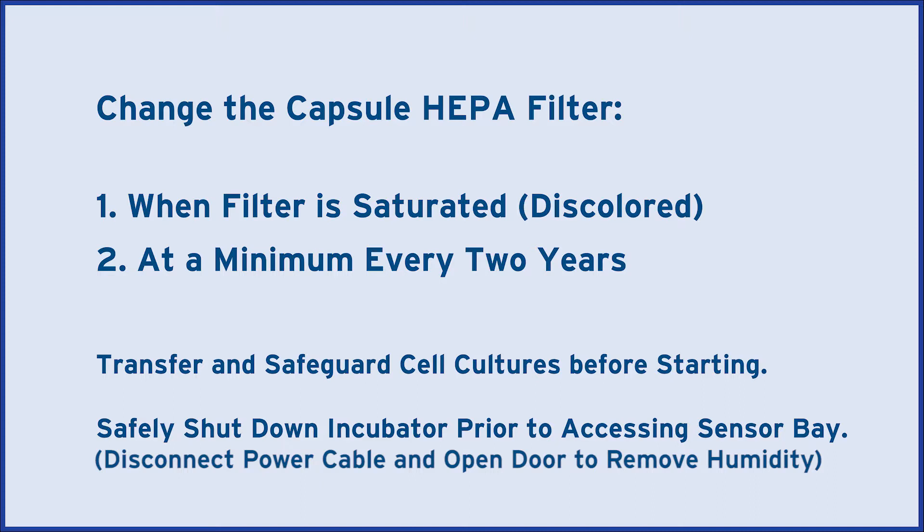Transfer and safeguard any cell cultures before starting. Safely shut down the incubator following the instructions in the manual.